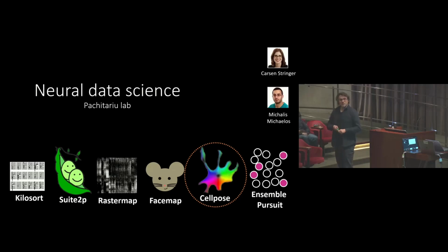And so we developed a cellular segmentation algorithm that hopefully, we think, is going to work on a very large range of types of image modalities, very different kinds of tissues and cultures and so on. And let me tell you how that works.